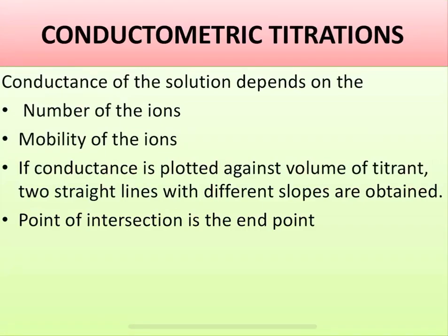Hello dear students. In this session let us discuss what is meant by conductometric titrations. In our previous class we discussed applications of conductance measurement. Conductance measurement is done in very special cases where we cannot employ the conventional method of titration.